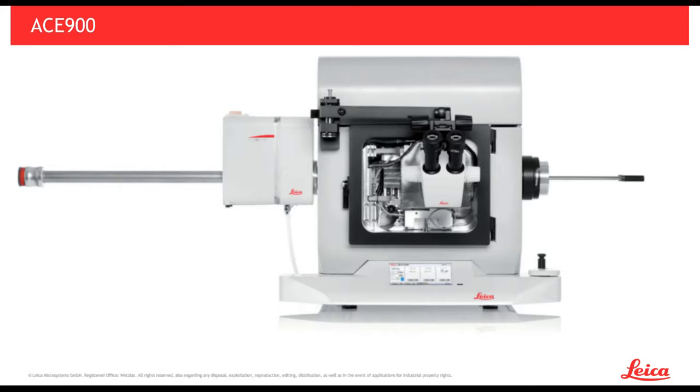So this would just sit where it's deposited and not form a crystal. Now, we found that basically any pure metal is going to crystallize under these conditions when deposited. This is especially known for things like gold, which are routinely used for SEM. But it is possible that a mixture of metals to form an alloy might be very suitable for this. And maybe some of the lighter metals may work quite well as well.